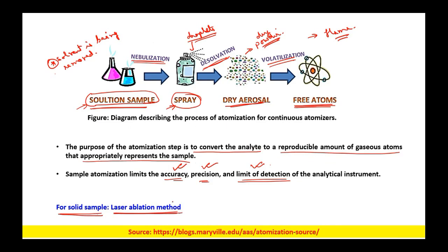In this laser ablation method, suppose you have a solid over here and you make a laser beam of high intensity incident onto the sample, and due to the incident high intensity laser source, the samples are directly heated and atomized.